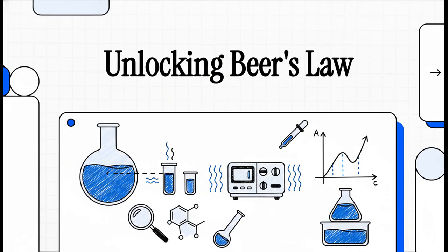Welcome to The Explainer. Today, we're basically scientific detectives on a mission to solve a chemical case. The mystery? Just how much stuff is really in a solution. And our secret weapon is a brilliant little principle called Beer's Law.